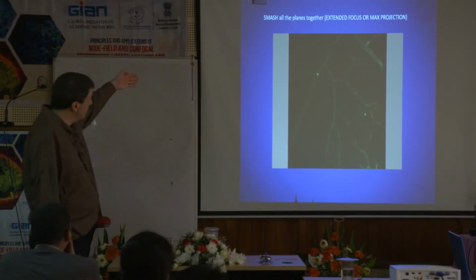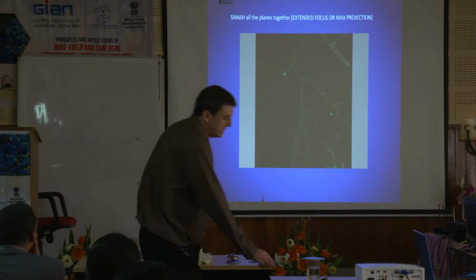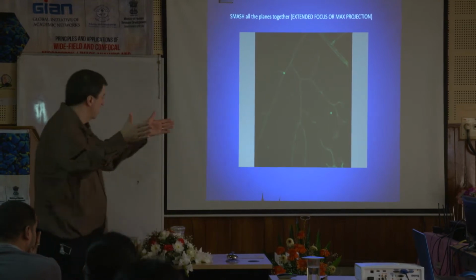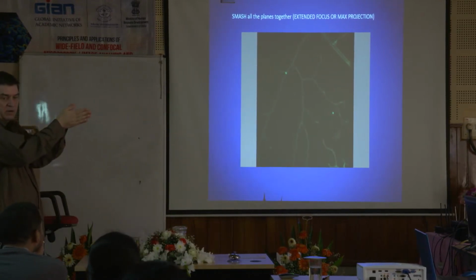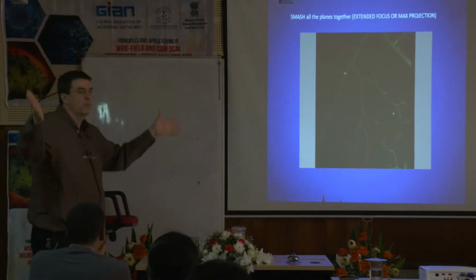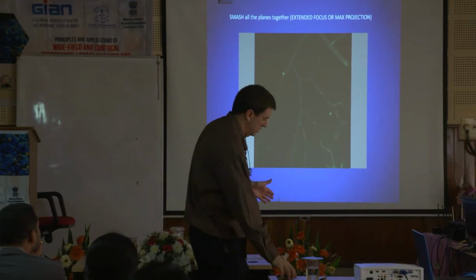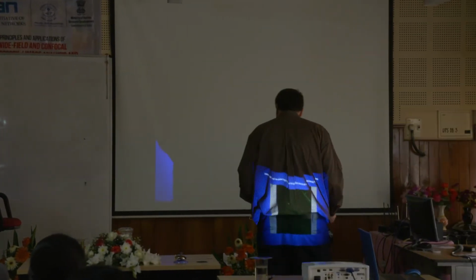So what we do is something called maximum projection. We take that deck of cards, and basically we smash that deck of cards into one card. How does it do this? Well, here's the way it does that. It takes every card, and what did we talk about yesterday? We talked about pixels, right?